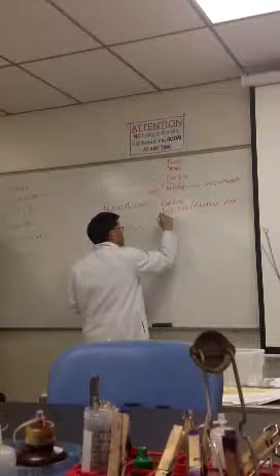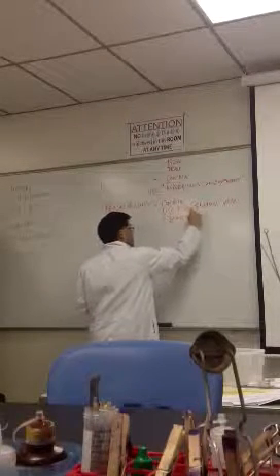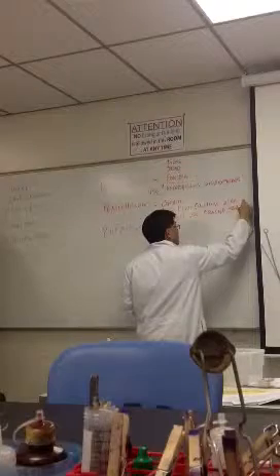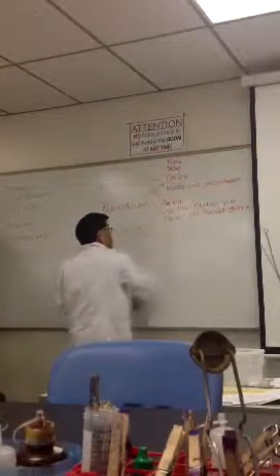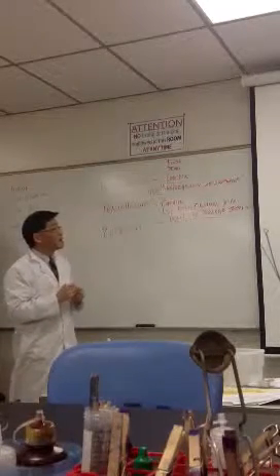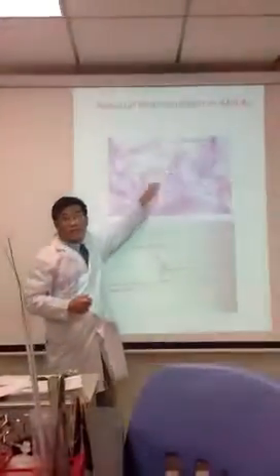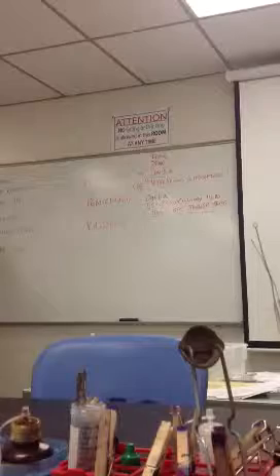Okay. Don't use the orange section, because that's not going to give you the right structure that we're looking for. Okay? It's going to be hard to find that section. Okay, find the structure, right? So that's what you want to do for the second one. In this case, you can just measure the length of the reproductive structure to get it here. That's fine.